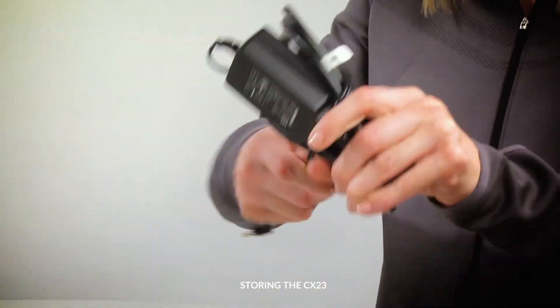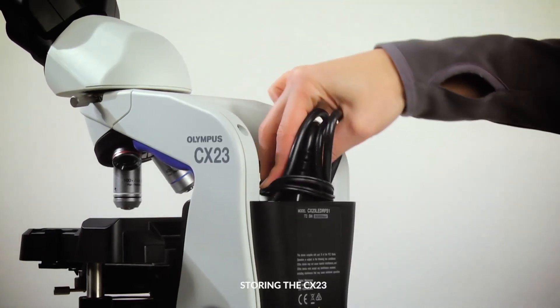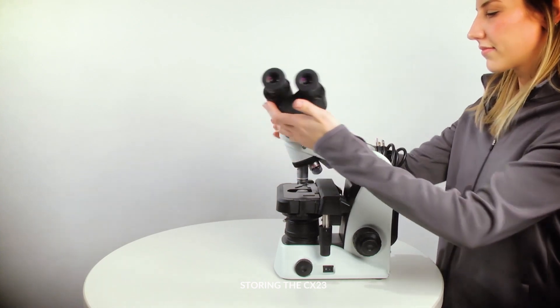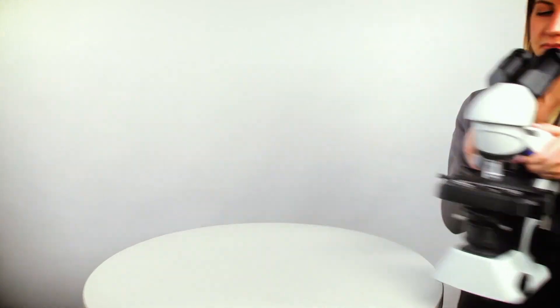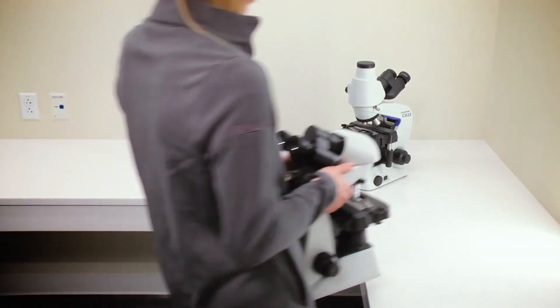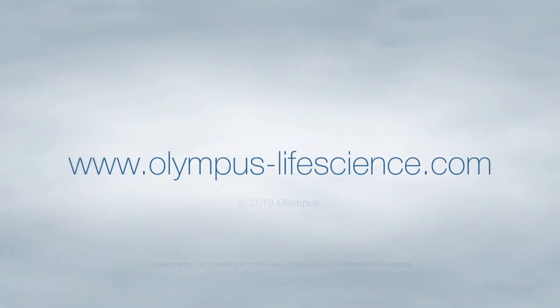Unplug the microscope, wrap up the cords, and store them in the back pocket. Rotate the observation head. Lift the microscope using the blue ergonomic carrying grips and carry it to its storage place.